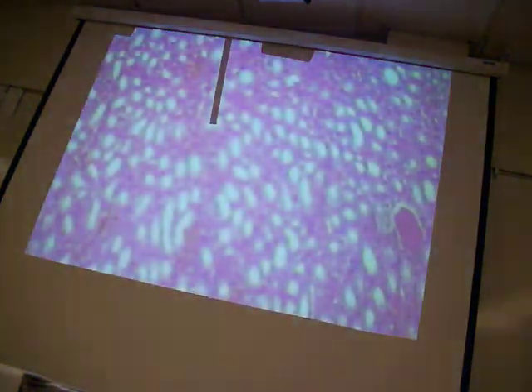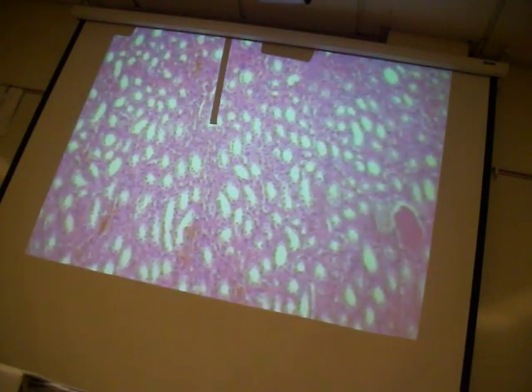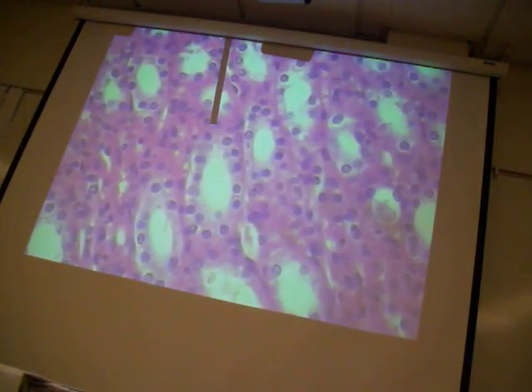So this slide that I'm looking at right here says epithelia, squamous, cuboidal, and columnar. So this tissue has all 3 on there, plus others. All right. So cuboidal, probably the easiest way to remember cuboidal is it's going to look like a little cube. Right? And on the lab practical, I always make sure that I put one on there that looks distinguishable, so that you can tell it's a cube. You don't have to question, well, is it really rectangular or not? One good area to look for these is little tubules. Down in our kidney tubules is a wonderful place to find these cuboidal cells.